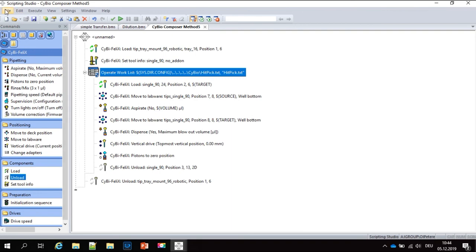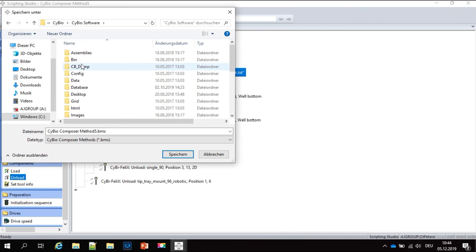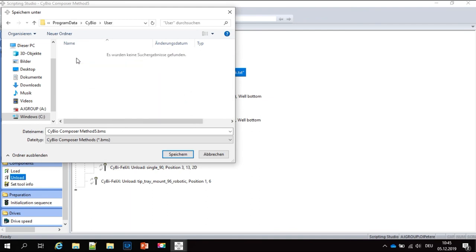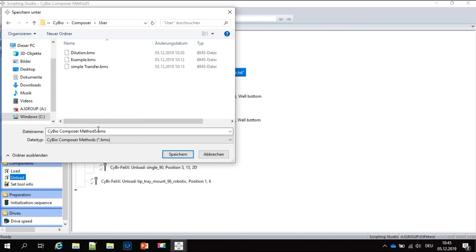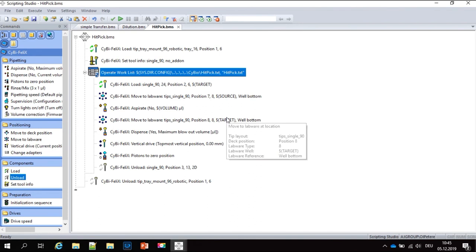We save the hit pick program, and now the program is ready to be executed — transferring hits from one source plate into a target plate based on a text file or database, whatever your data source is.